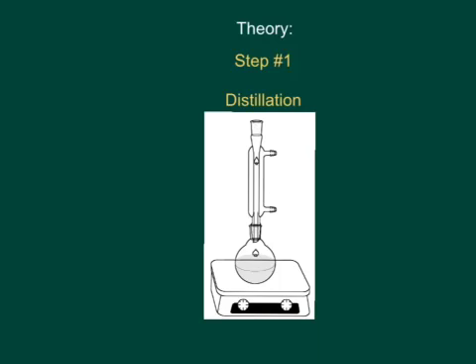Now, the reason for the sodium carbonate inside the light bulb flask is because, in addition to caffeine, there are other substances inside the tea leaves that are not just soluble in water but also methylene chloride. For example, tannins. Caffeine and tannins are both being extracted from the tea leaves and are both soluble in methylene chloride and water.